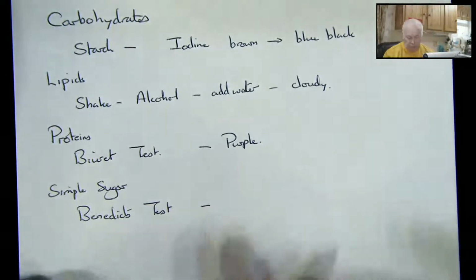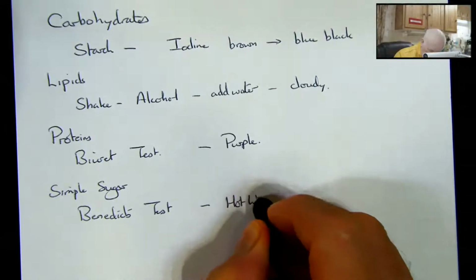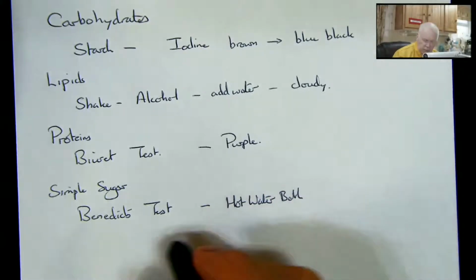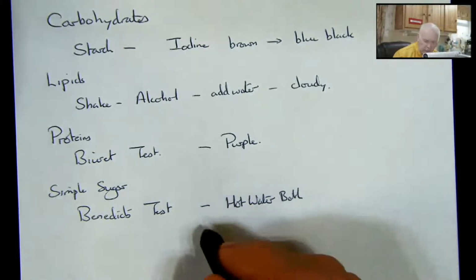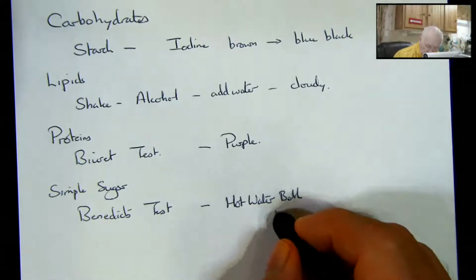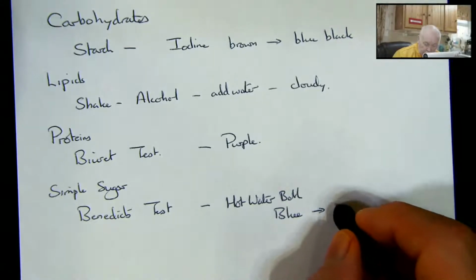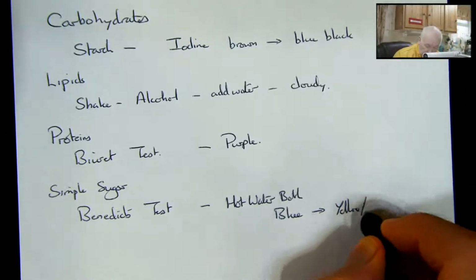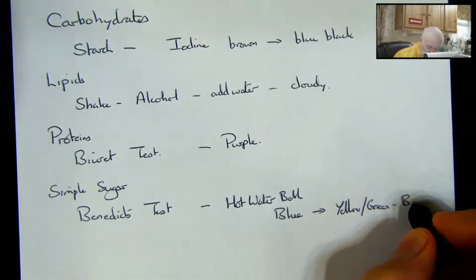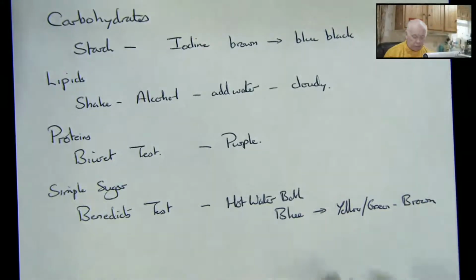Hopefully, if this is working in a hot water bath, if we've got any simple sugars present, it should turn from blue. Maybe we'll get a yellow, sort of green color, and maybe we'll get some sort of brown color if it really works well and we've got a lot of simple sugar.